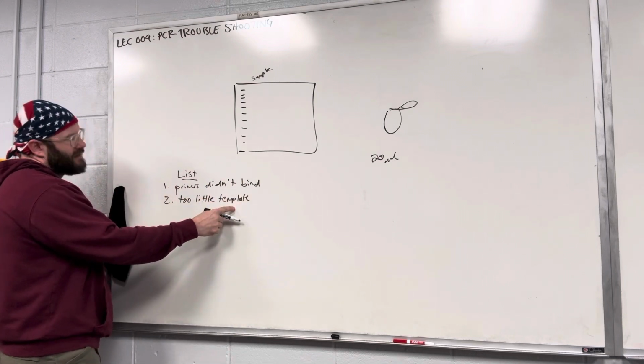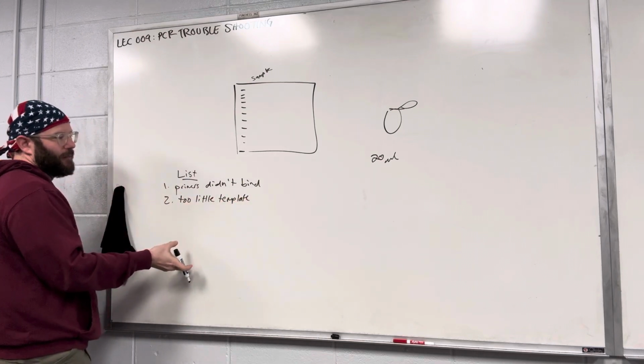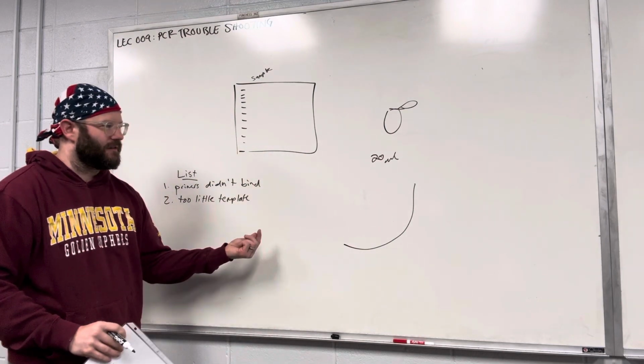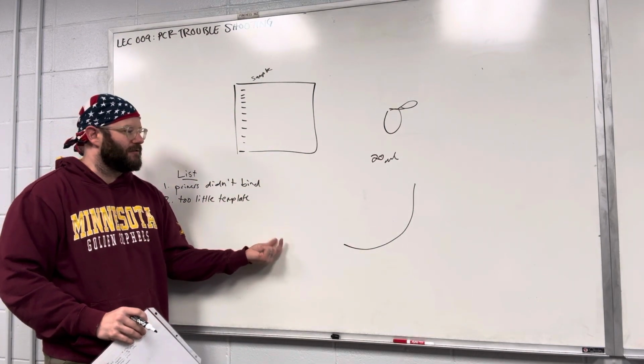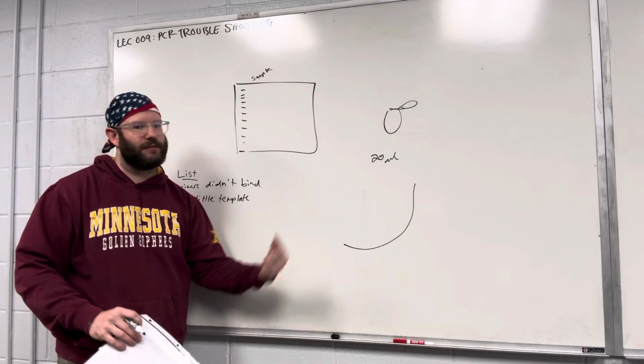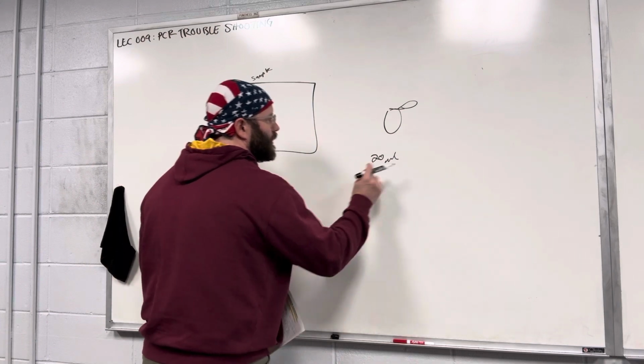It can happen, but because PCR is exponential, the strength of PCR is that you only need a tiny, tiny, tiny amount and it can exponentially expand on it. So that can be a problem. We'll keep it on the list.